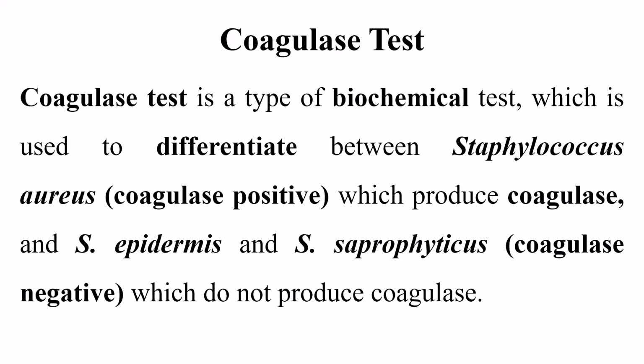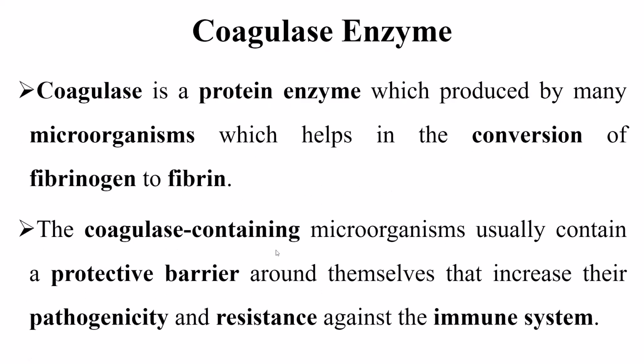We have many other species of Staphylococcus, but those are the main medically important species. The others, such as saprophyticus and epidermidis, do not produce coagulase enzyme.